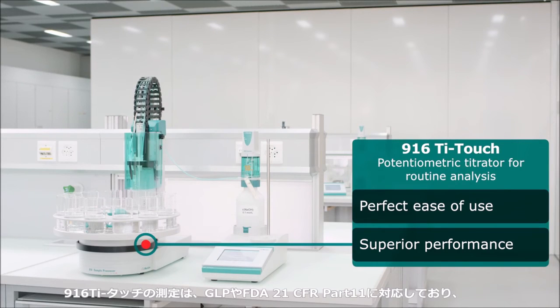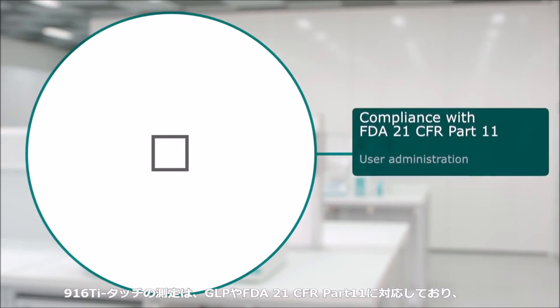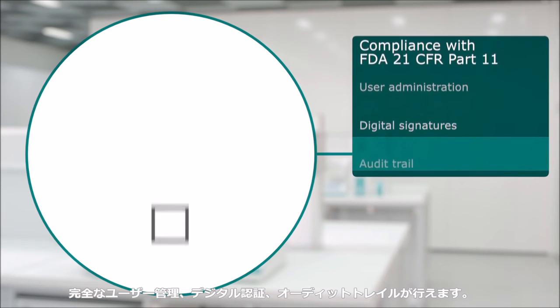Measurements with the 916 T-Touch are fully compliant with the requirements of GLP and FDA 21 CFR Part 11, complete with user administration, digital signatures, and audit trail.